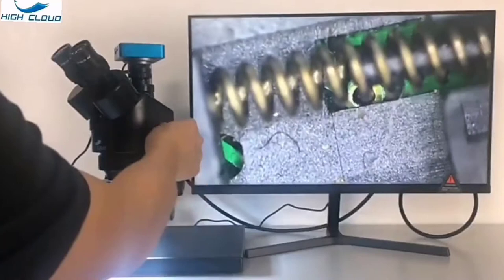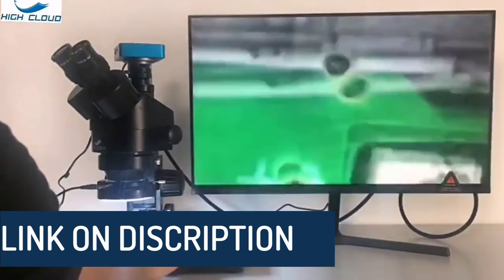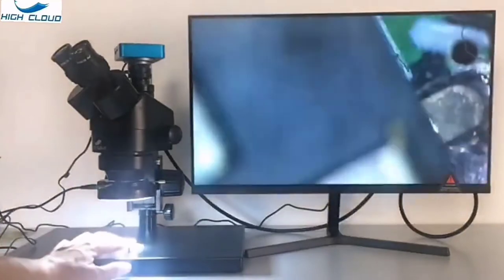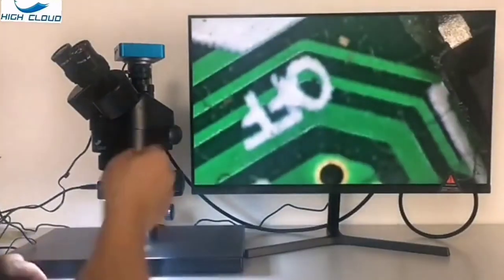High resolution with great flatness and contrast. Sharp stereo erect images over a wide field of view. Crystal clear original true color images. Large working distance. Accurate alignment ensuring a fatigue-free viewing. Full optical glass elements, precise ground glass lens. All metal mechanical components. Adjustable interpupillary distance. Manufactured under ISO 9001 quality control standard.